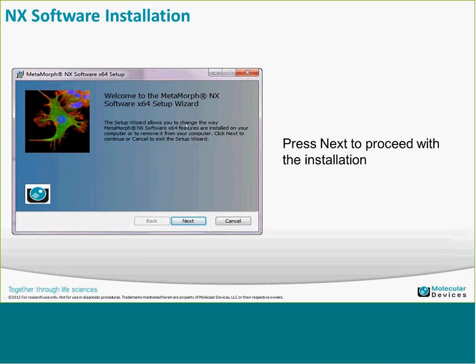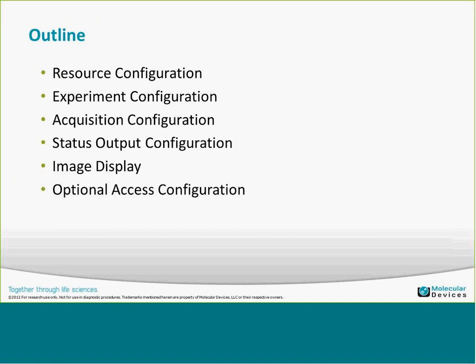Then launch the software. Looking at the Metamorph NX configuration settings, these are settings you can customize within the application itself. We'll walk through resource configuration, experiment configuration, acquisition, status output, image display, and optional access controls.